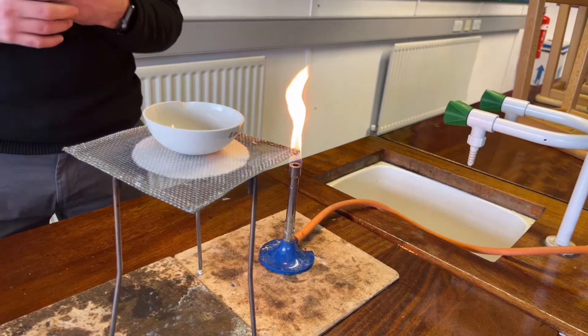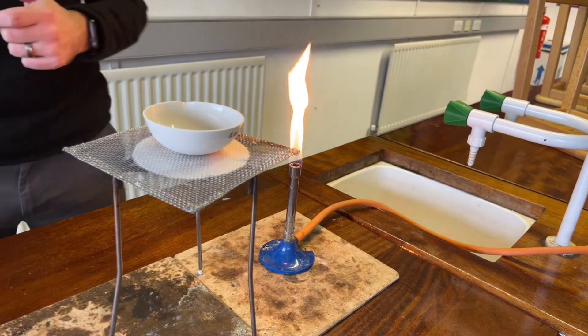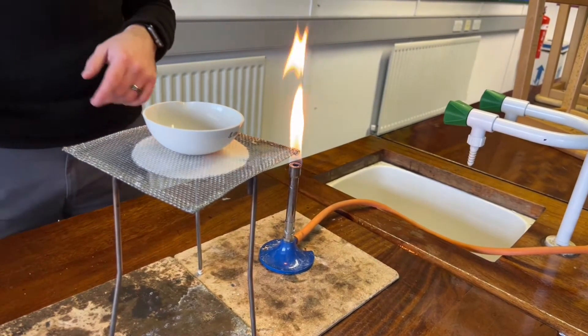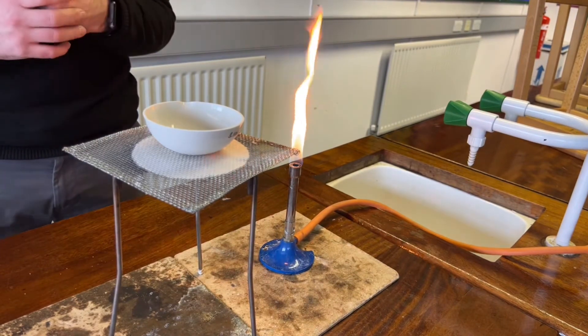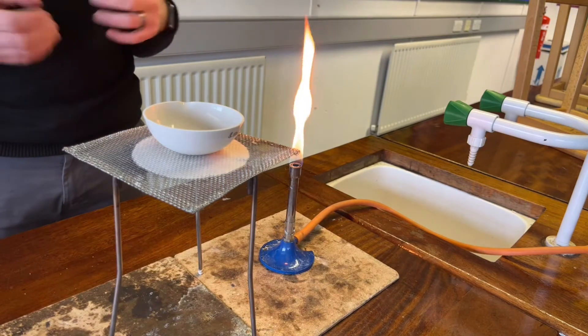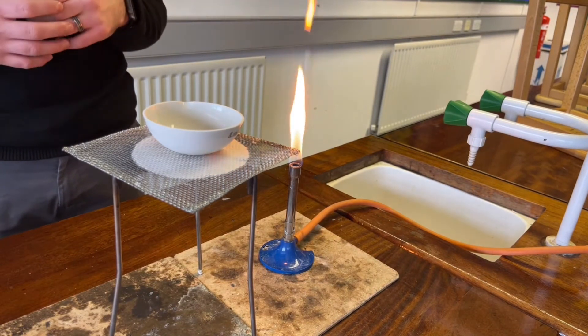What we are looking to do now is evaporate off the water and collect pure sodium chloride. The method in which we should do this is by placing an evaporating basin and heating gently until all of the solvent — the water — has evaporated, and we should be left with the solid sodium chloride.